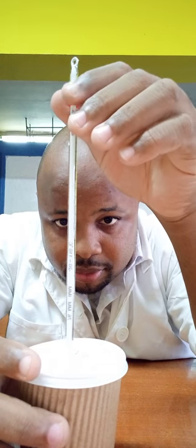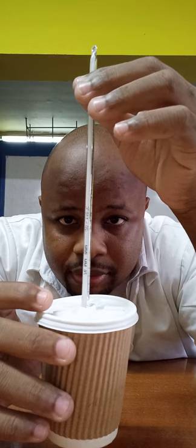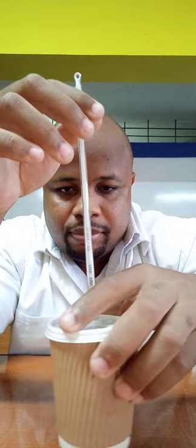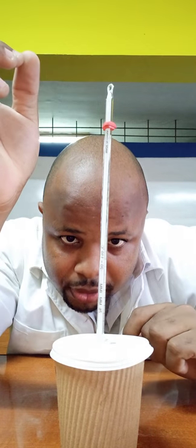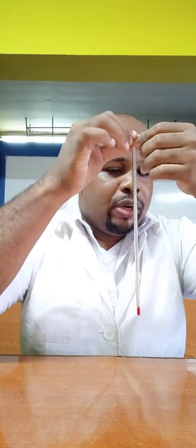I'm just going to wait — remember it was at 26. It's now gone below 26, it's at 20... it's at 24. It's dropped to just below 24. This one finished at 23.5, so it moved from 26 degrees Celsius to 23.5 degrees Celsius.